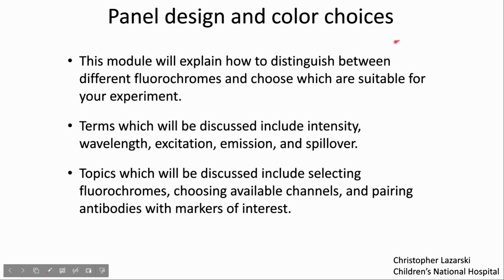This module for our flow core will be on panel design and color choices for your experiment. I am Christopher Lazarski, the director of the flow core at Children's National Hospital. We're going to explain how to distinguish between different fluorochromes and choose which are suitable for your experiment.